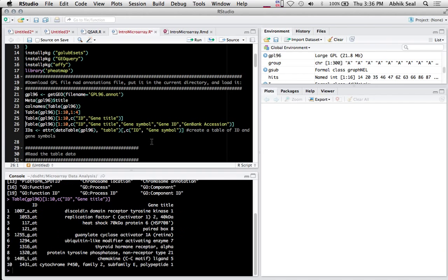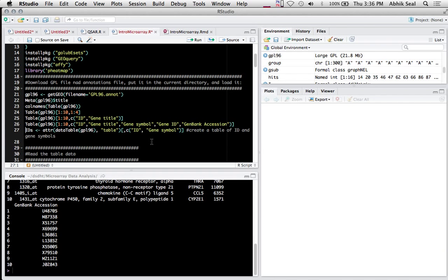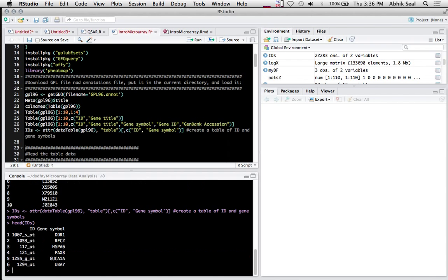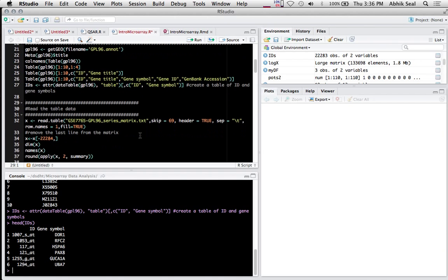You can subset the columns - the ID and gene title, gene symbol, and GenBank accession. I've collected the IDs with the gene symbol names. The ID is the Affymetrix gene ID which corresponds to the genes.